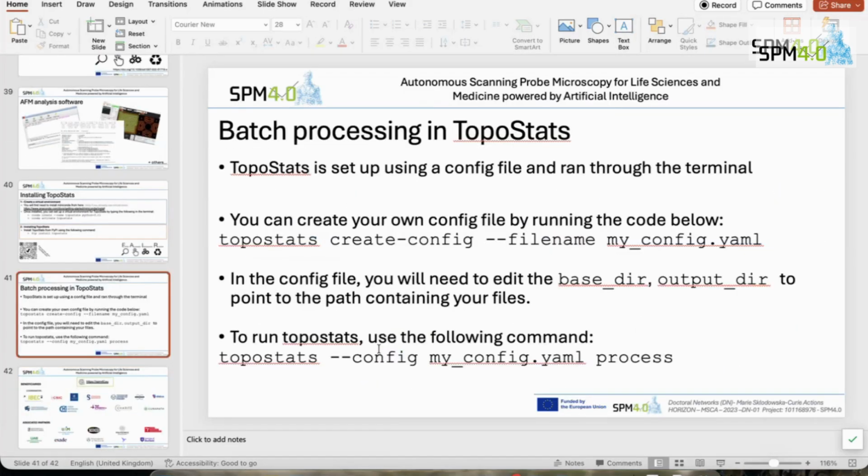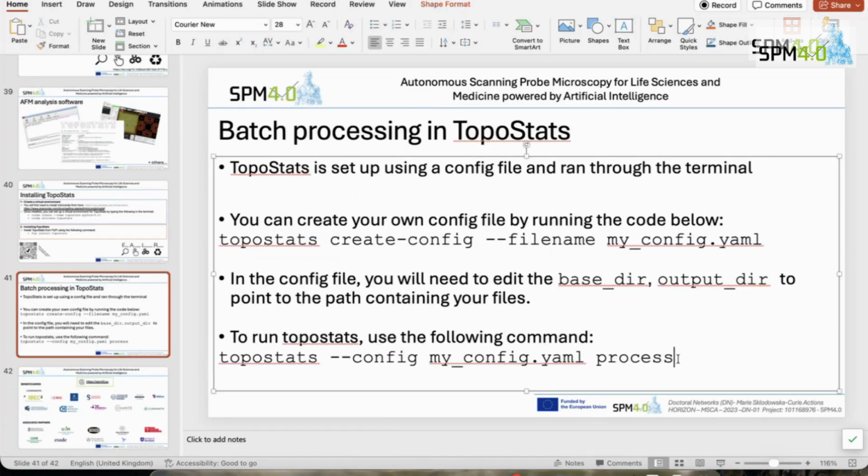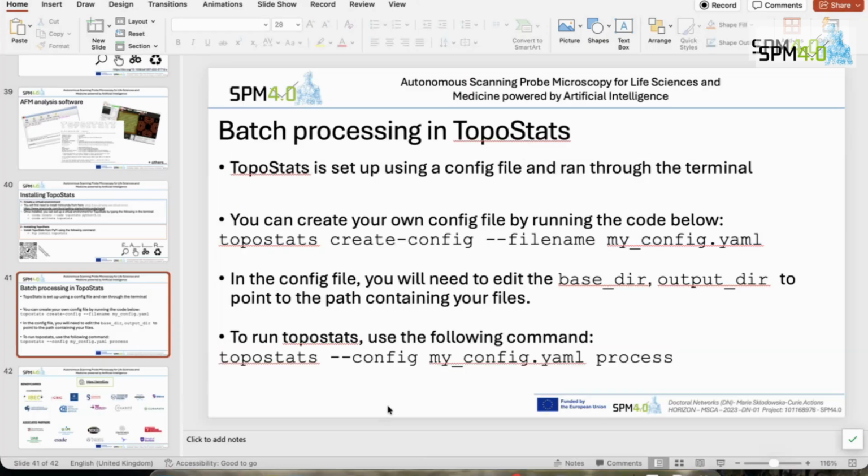Or other people, just the 5 minutes. So base structure: where it says dot slash, you delete the dot slash.